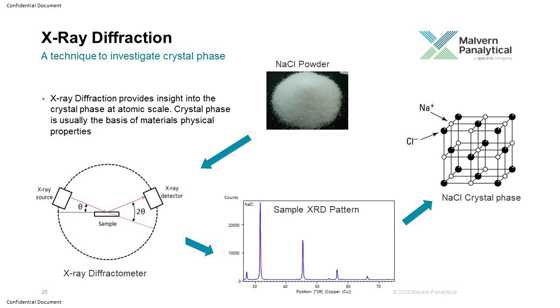So this is the technique: you have your sample, mostly measured in powder form, but of course you can also directly analyze the battery cell, which I will come to. You put your sample into the diffractometer. There is an X-ray tube and an X-ray detector, very similar to what you have in XRF. The geometry is different, and here, instead of white radiation, we use monochromatic radiation. The sample is at the center.